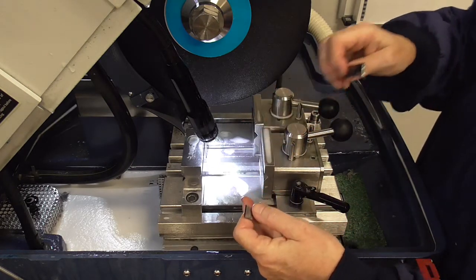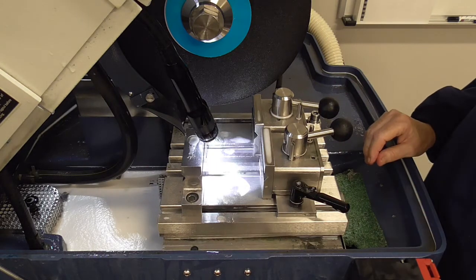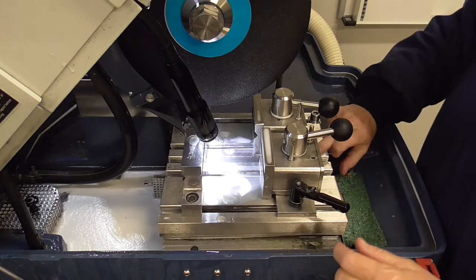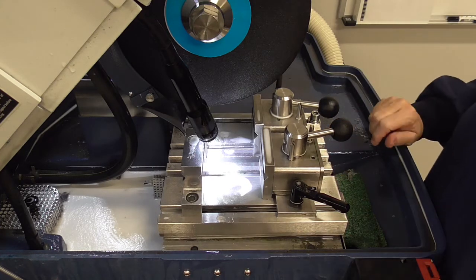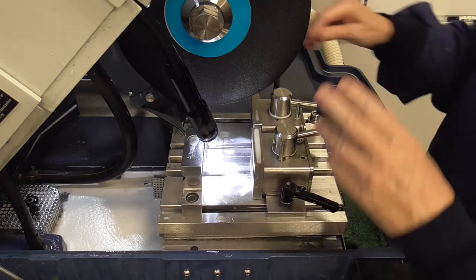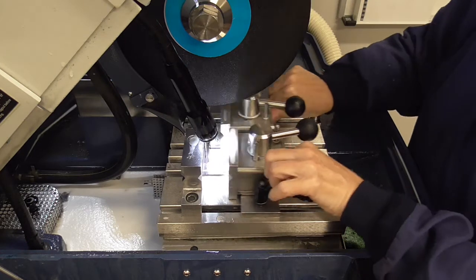Sometimes the smaller pieces will fall down in here. There's a basket in the center to catch any piece that falls. Now you're ready to position a second sample for a second cut.